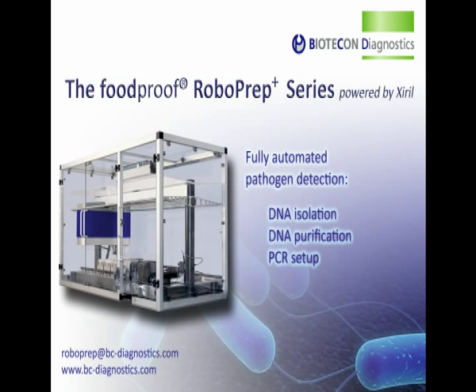Welcome to Bioticon Diagnostics video presentation of the new Foodproof RoboPrep Plus series. This new technology provides a fully automated solution for the rapid detection of pathogens in food samples by real-time PCR.